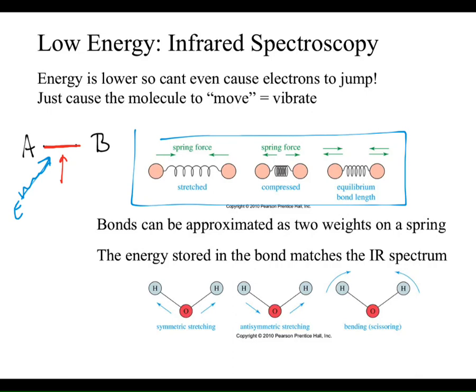That spring can cause those atoms to oscillate back and forth on each other. And what we're looking at is a stretch of the bond. This is at its most basic, simple level. That stretching force gets tied to the spring constant, if you really wanted to deal with physics. I don't really want to, but that's what's being compared.